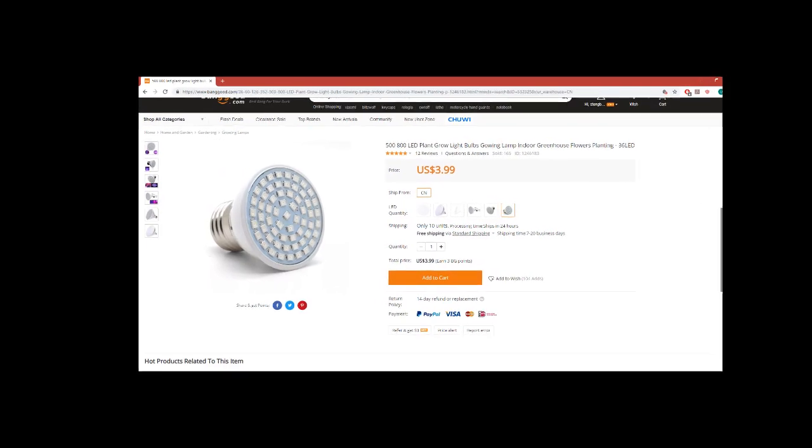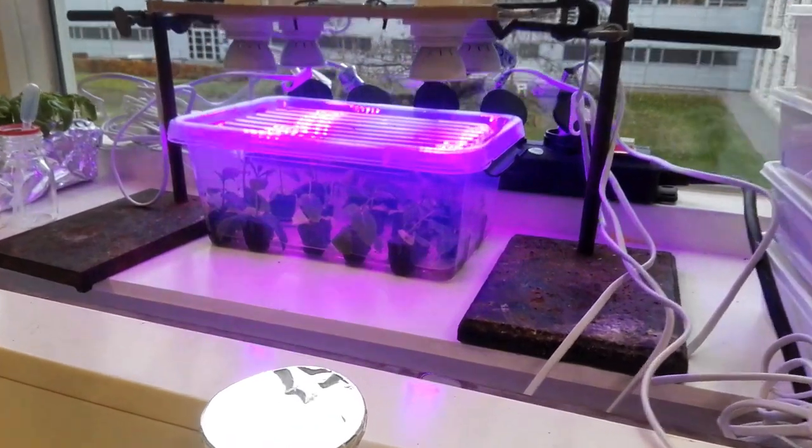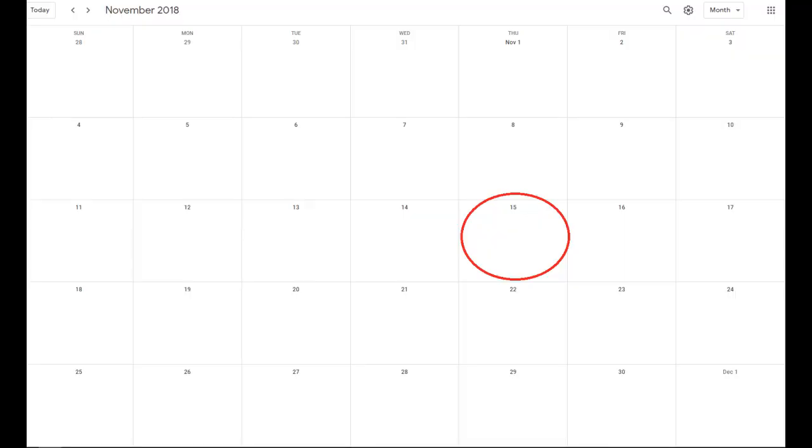Buy some lamps, and your mint will grow faster than you can say gold tetrachloride. We made a little setup to hold the lamps and the camera and left the plants to grow. After a week, they had formed enough roots to start our experiment.